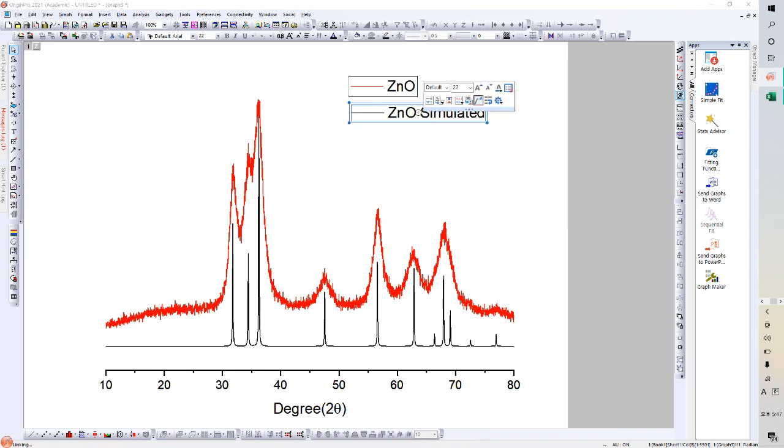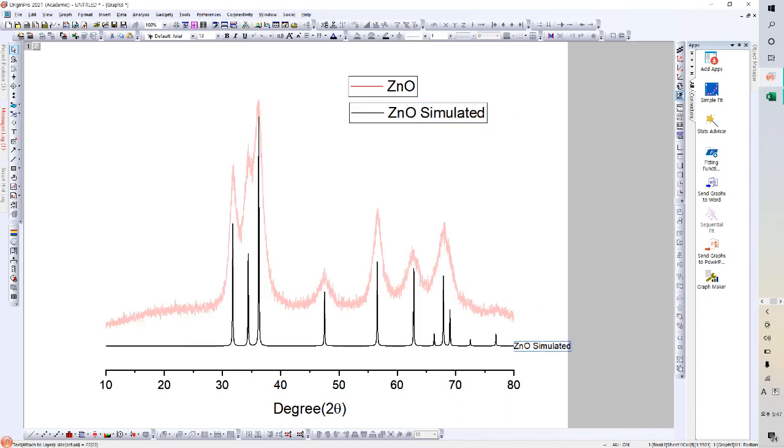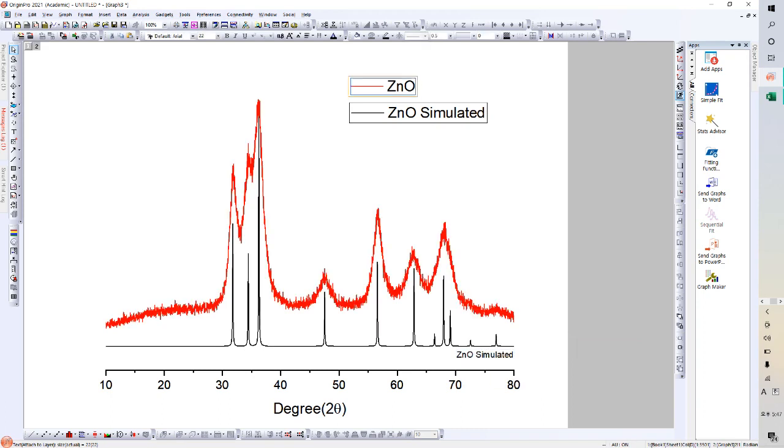There's also a label function which attaches labels to plots, and you can always change the location and where you will put the label. For me personally, this takes up less space when you make the graph, so I use this more often. And change it to here, and if you delete this, this is another way to make a good graph.